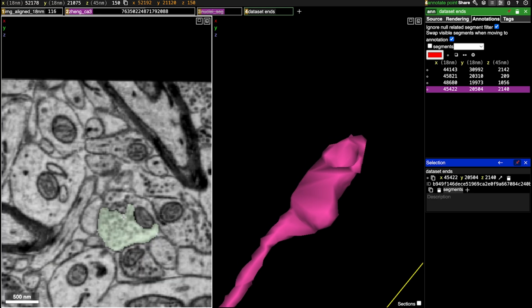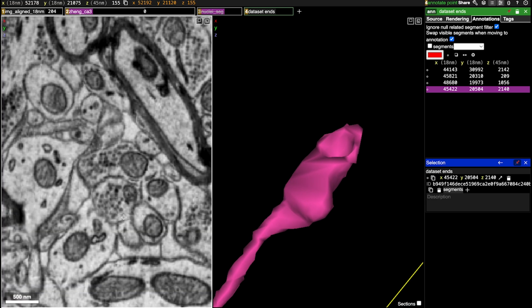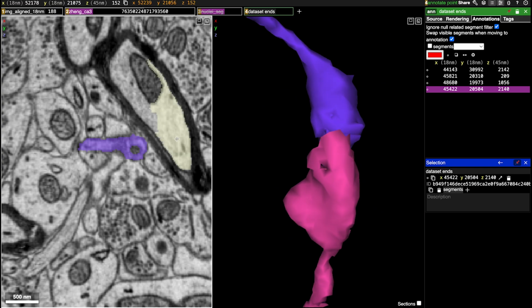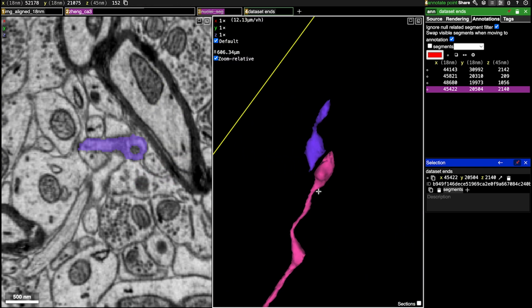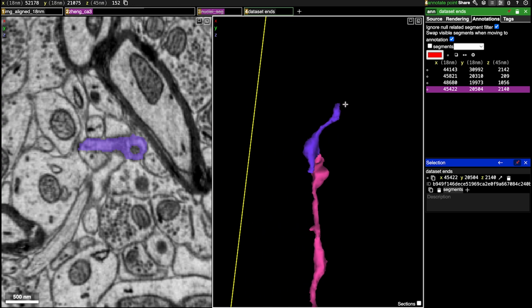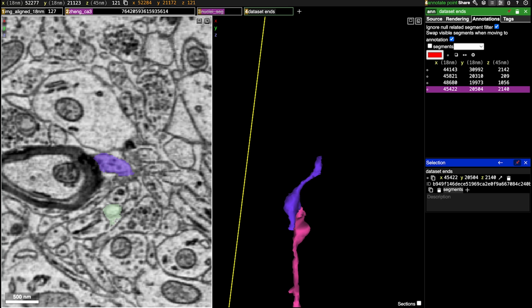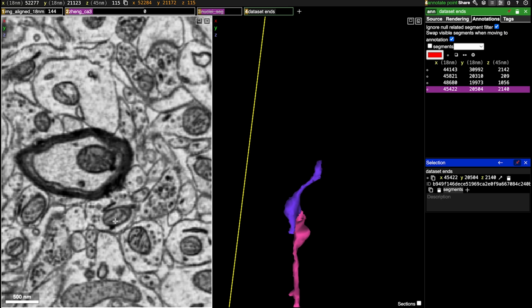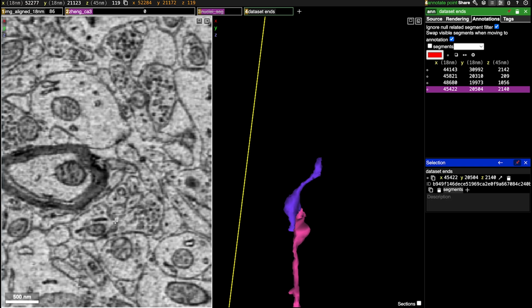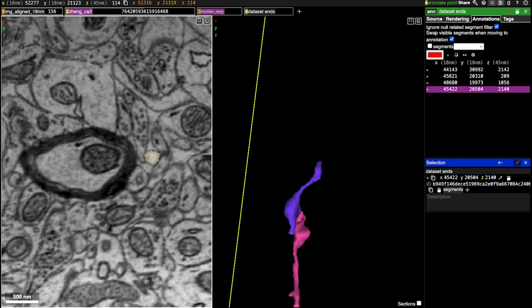And here, got a little bit of a jump, but the shape here we can follow, so hopefully that'll be the extension. Okay, that looks good. Even though they're a little bit off center from each other, the shape looks consistent, so that's good. Okay, let's see here. Okay, I think it's this one that we're following.